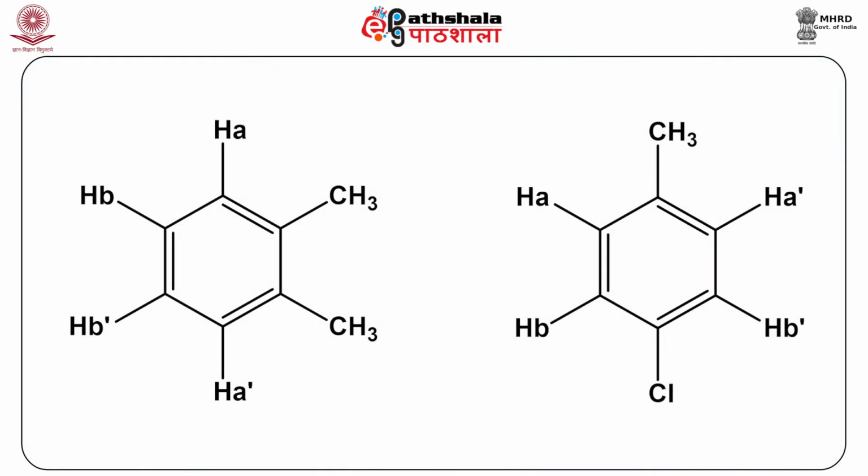The magnetic inequivalence phenomenon can be seen in ortho-disubstituted compounds when both the substituents are the same, such as ortho-xylene, 1,2-dichlorobenzene, 1,2-diaminobenzene. Now, it is clear, students, that both HA protons and both HB protons are chemically equivalent due to the presence of the plane of symmetry bisecting the 1,2 and 4,5 C-C bonds.